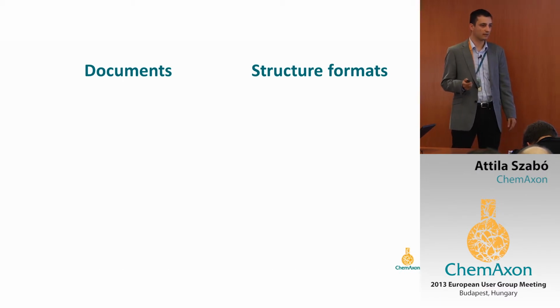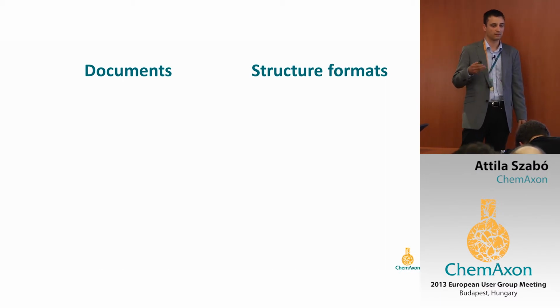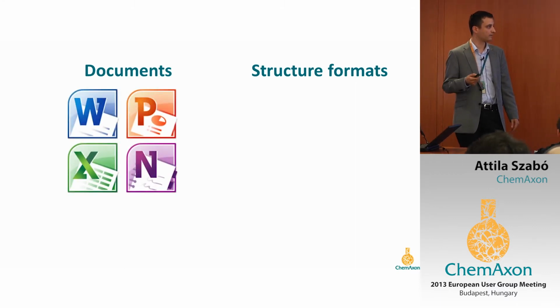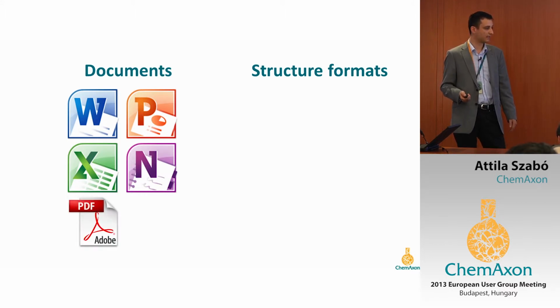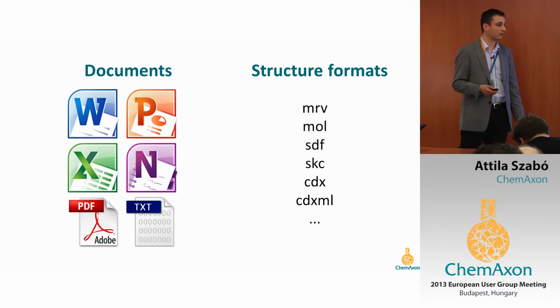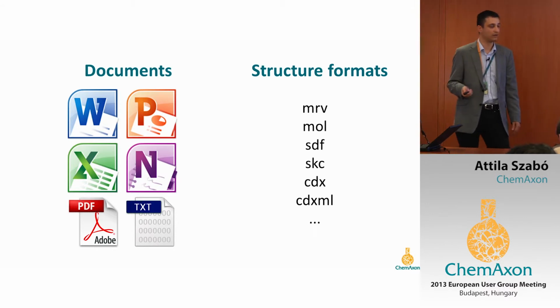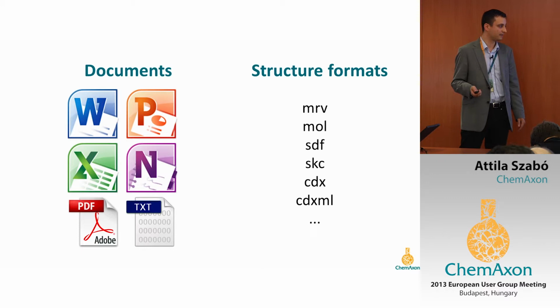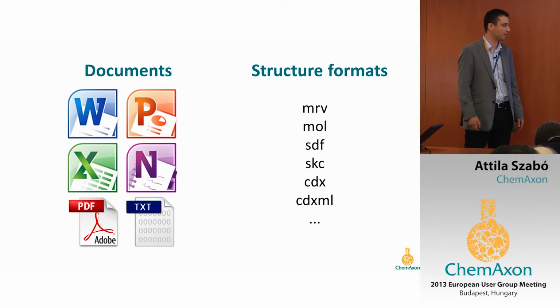Now let's have a look at what formats are supported. Of course, Office documents, Word, PowerPoint, Excel, and PDF, and text files, and almost all common chemical structure formats like MRV, MOL, SDF, SKC, CDX, and CDXML, and so on.